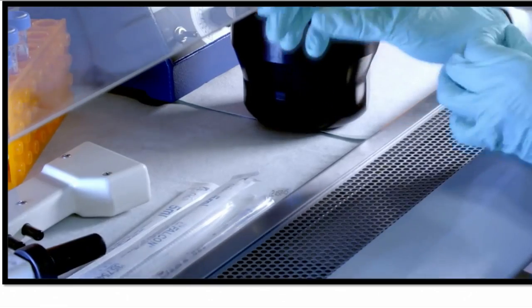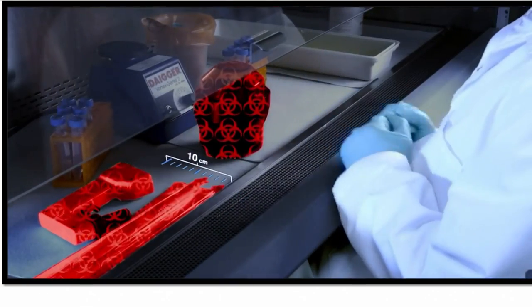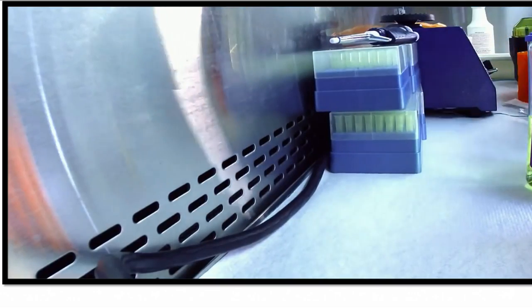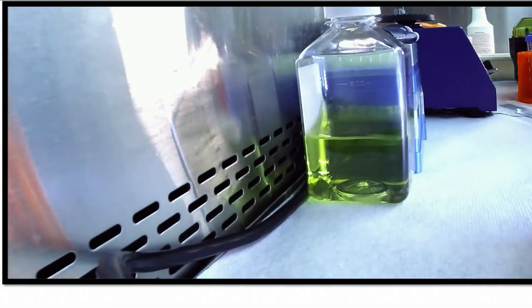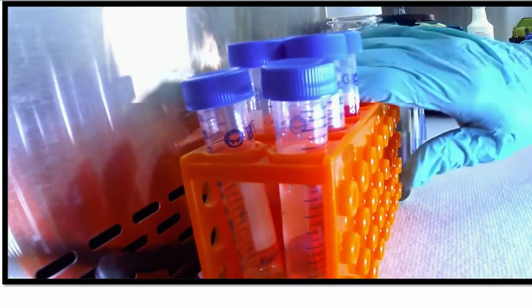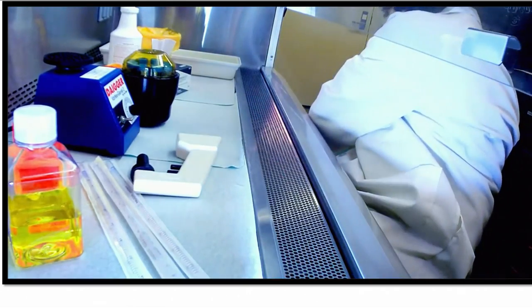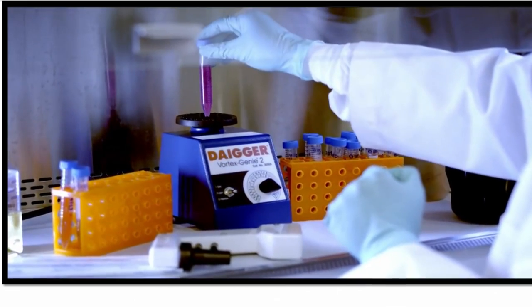Please keep in mind that you must work at least 10 centimeters inside the BSC. To guarantee uninterrupted airflow, cabinets should never be overcrowded. Overcrowding the BSC can block air grills. Airflow can also be disrupted by sudden or sweeping movements. Slow, direct movements work best.